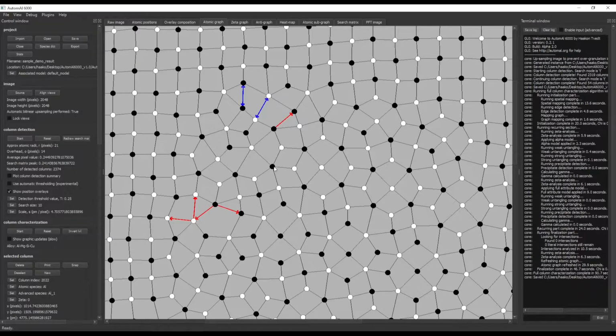So this atomic graph is actually a digraph, which means that the edges between the vertices have direction. You see this, for instance, here there's an arrowhead pointing this way. This means that this edge is pointing this way. All the other edges, or most other edges, are black or have arrowheads both ways. When they are just a thin black line, it means it has two edges, one going this way and one going this way. So it's a symmetric arc. And symmetric arcs is what we want.